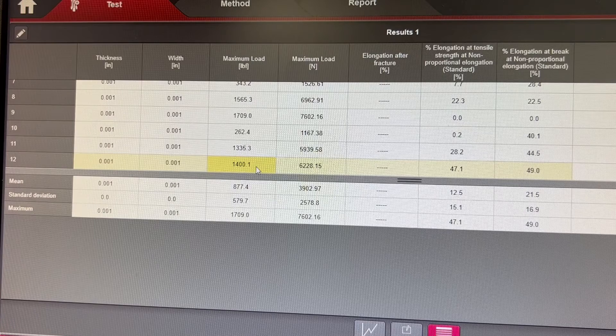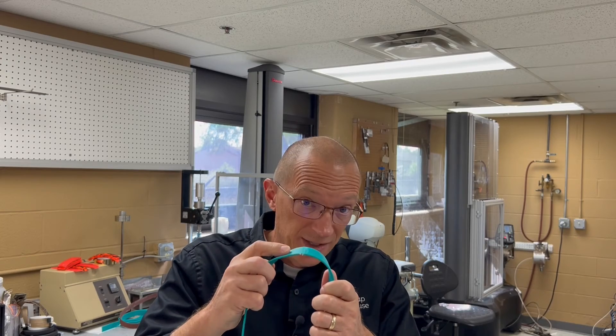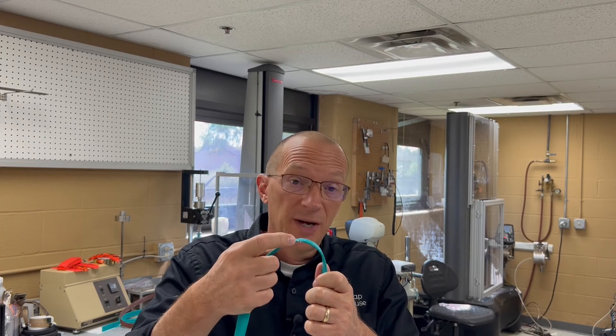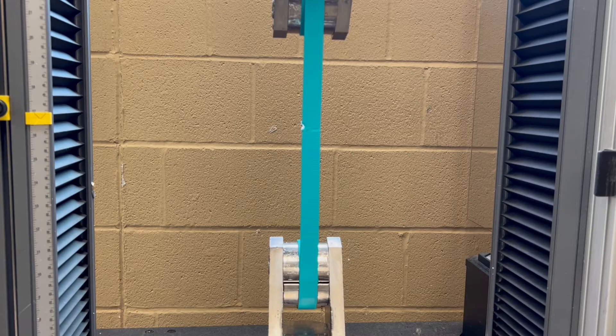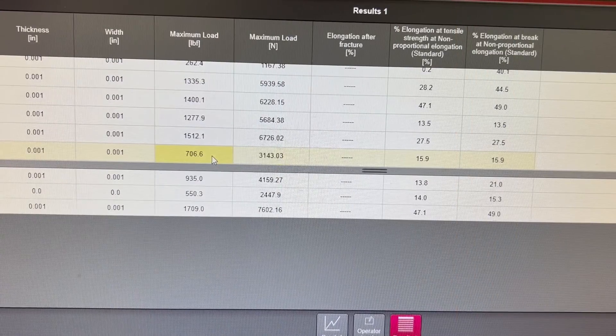This sample broke at 1,400 pounds. The second piece is again beta standard, but this piece has some edge wear. The edge wear sample broke at 706.6 pounds.